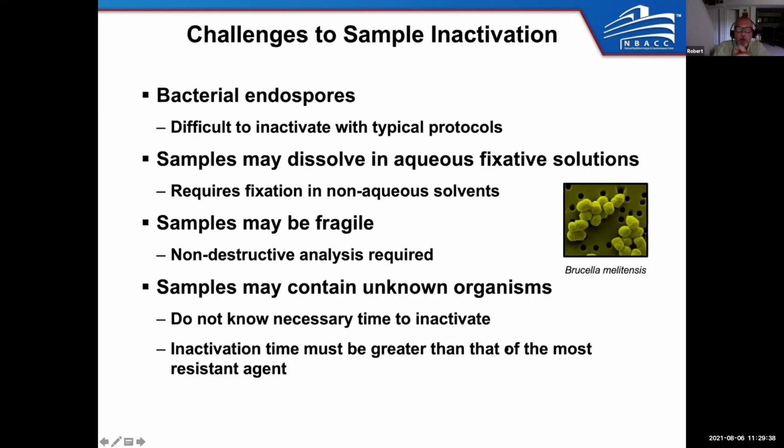So the hardest thing for us to actually inactivate are bacterial endospores. We look at lots and lots of bacteria, we look at lots of viruses, and bacterial endospores are the hardest thing to inactivate. So this is what we set our baseline with initially. And it doesn't matter all the work that we've done in the past, we still have to go back and revalidate every protocol with that fixative. So samples that we get that may dissolve in aqueous fixative, we had to develop solutions for that.